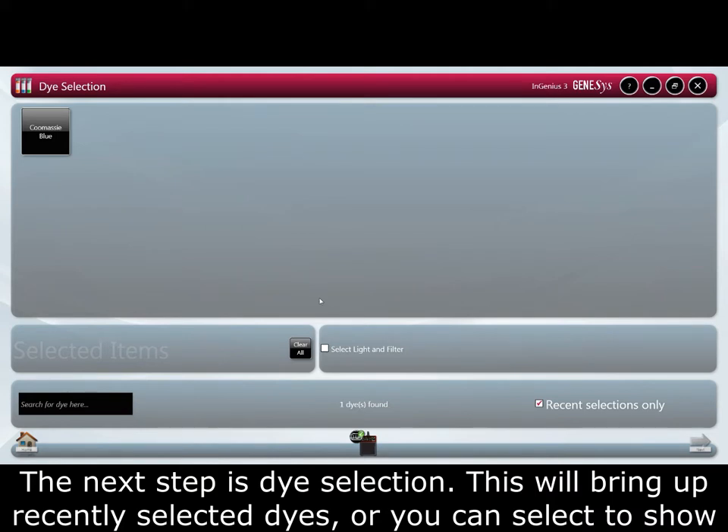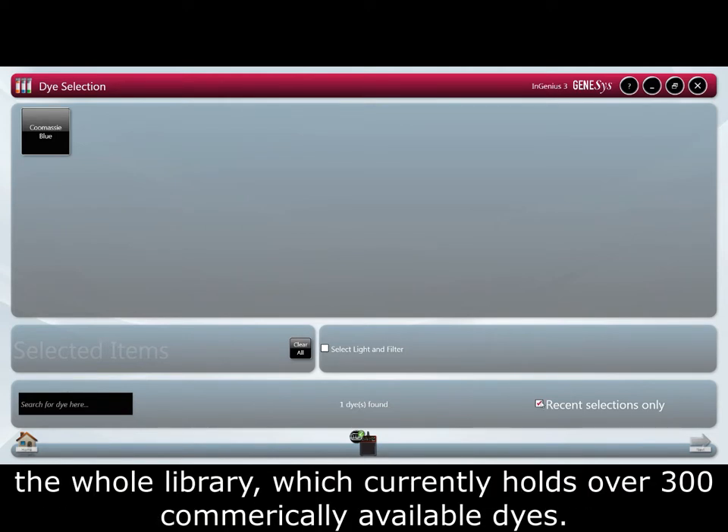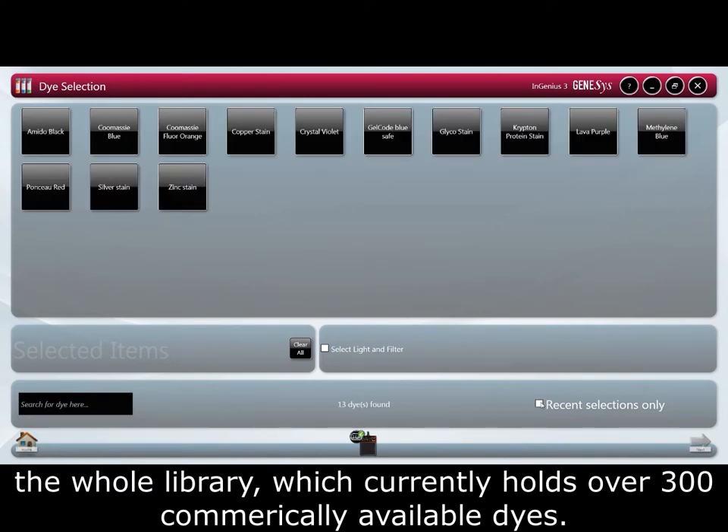This will bring up recently selected dyes, or you can select to show the whole library that currently contains over 300 commercially available dyes.